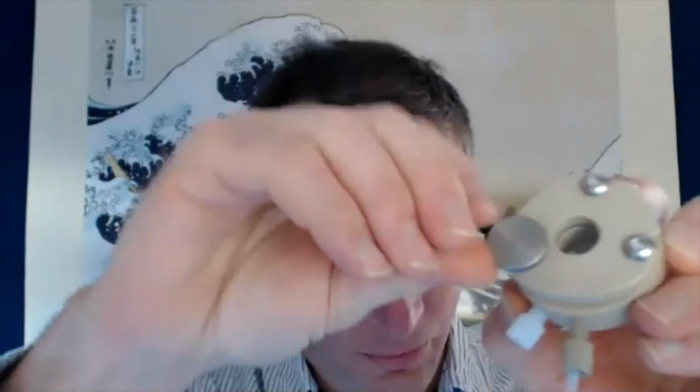There's a thumb screw on the front. If you take that off, you can get into the inside of the fReactor. There's a glass window, and then there's a little magnetic stirrer. Reassembly is just the opposite process. So if you need to get in and clean these things out, or after you've finished your reaction, you can do that and just reverse it. Very quick and easy to assemble and disassemble.